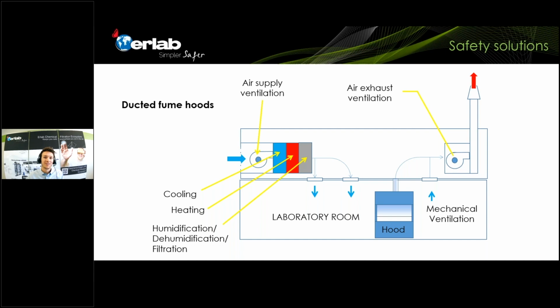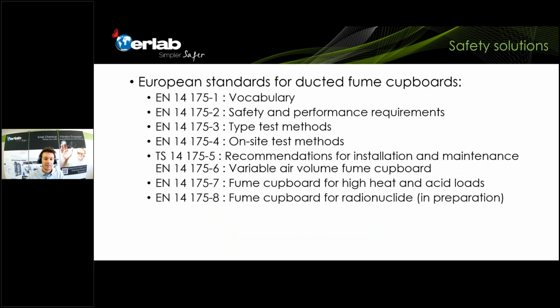So I just realized there is a short delay in the slides, so I'll try to go a bit slower when I start my explanation. I will still talk about ducted fume hoods, but on the next slide, that will maybe appear for some of you in a few seconds, you will see some European standards about ducted fume hoods.